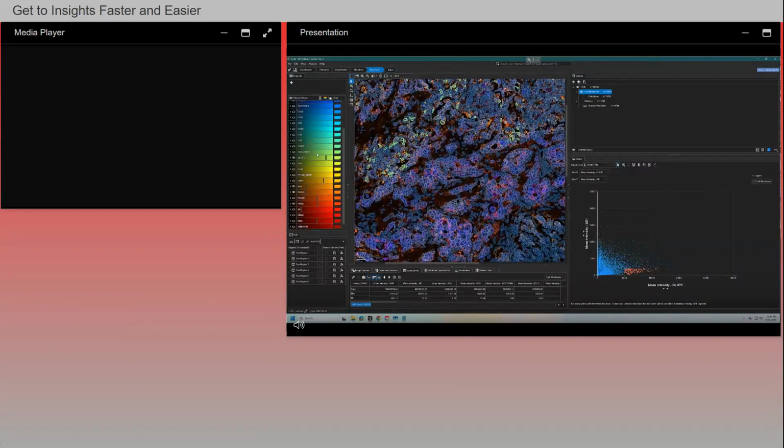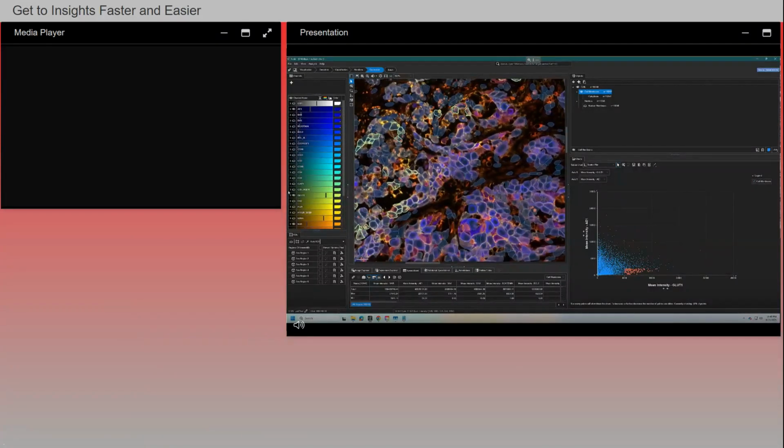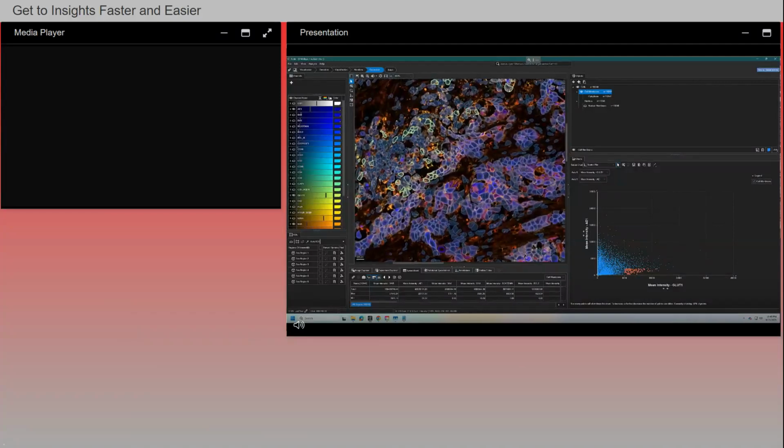They're around here. I'm going to actually select a bit more to include more cells here. So what we're looking for will be cells that are high in this green-yellow channel and low for blue. Zooming in closer, I would say some of these cells like here indeed conform to what I'm looking for, so I'm going to assign these cells to a hypoxic tumor.